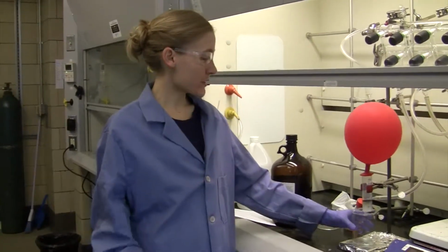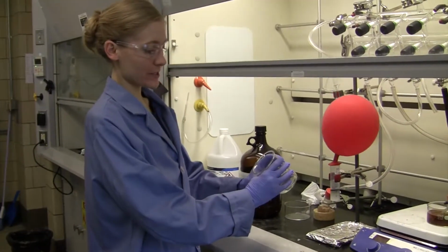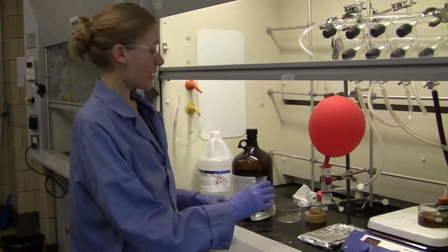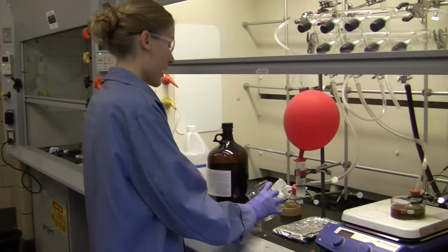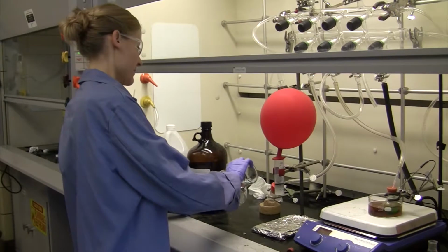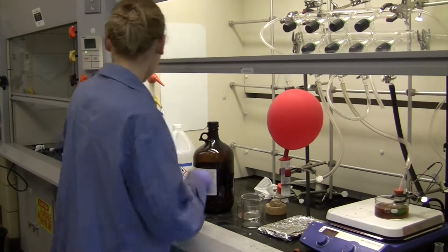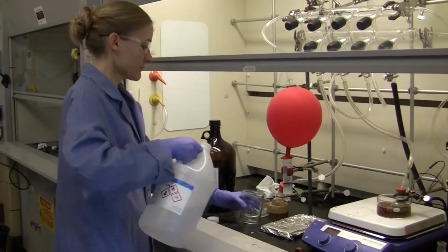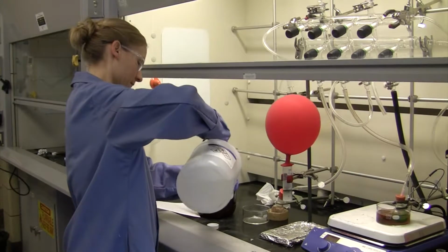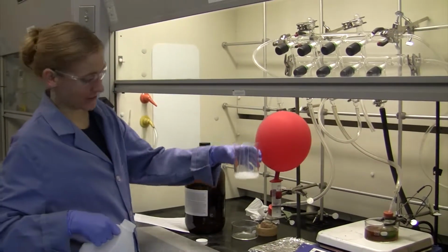Okay, so our polymer came all the way through our plug, and so now we have our nice concentrated solution in chloroform here. What we are going to do is precipitate it into methanol. And so, pour this out, and take some methanol. You can see there was a little bit in here already. It's already starting to precipitate.